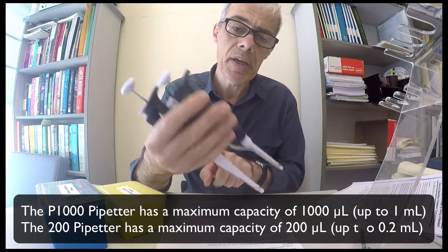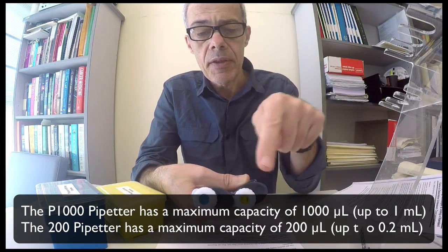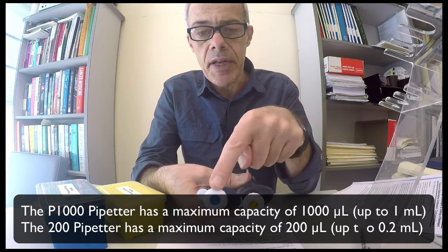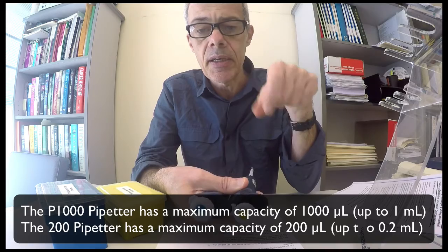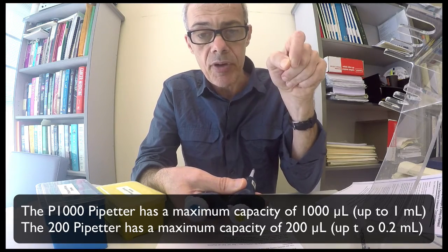So this is the P1000 and this is the P200, named according to the maximum volume they can dispense expressed in microlitres.